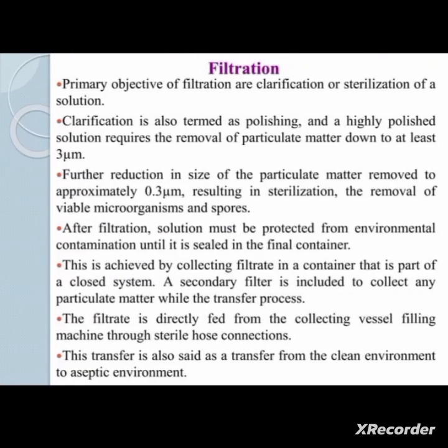Filtration. The primary objectives of filtration are clarification or sterilization of a solution. Clarification is also termed polishing, and a highly polished solution requires the removal of particulate matter down to at least 3 micrometer. Further reduction in size of the particulate matter removed, to approximately 0.3 micrometer, results in sterilization, the removal of viable microorganisms and spores.